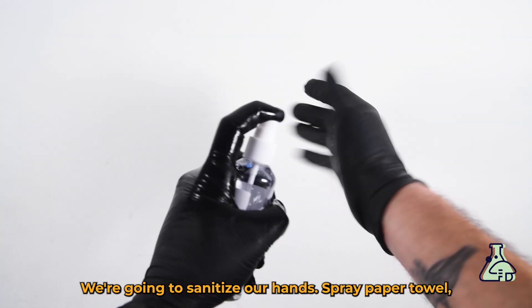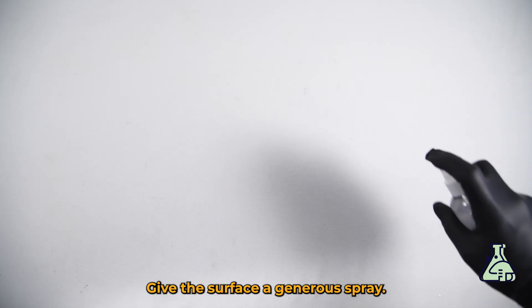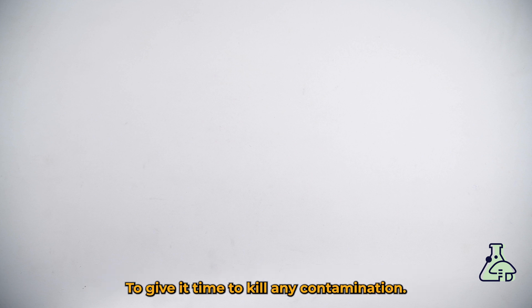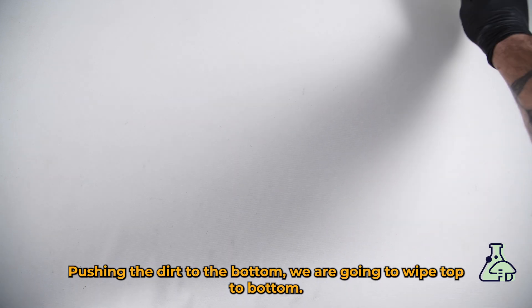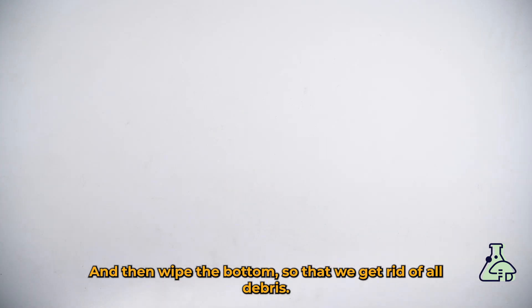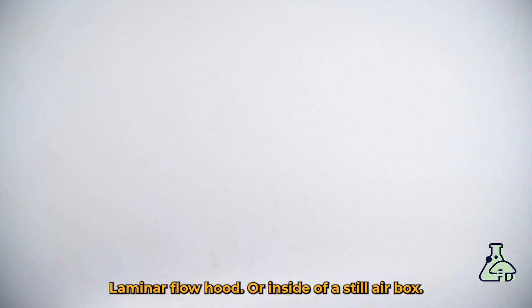We're going to sanitize our hands, spray a paper towel, and give the surface a generous spray. It's important that we leave the alcohol to rest for at least a minute on whatever surface we're spraying to give it time to kill any contamination. Pushing the dirt to the bottom, we're going to wipe top to bottom covering all of our workspace. To reduce the chance of contamination, it's important that you do this either in front of a laminar flow hood or inside of a still air box.